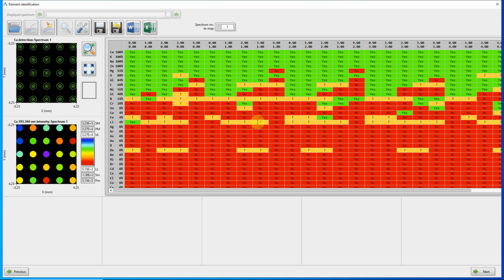Note that as the raw spectral data used to generate the analysis results are not included in the files, neither the full spectra nor the peaks used for identification will be displayed. The table of identification results can be ordered as before.